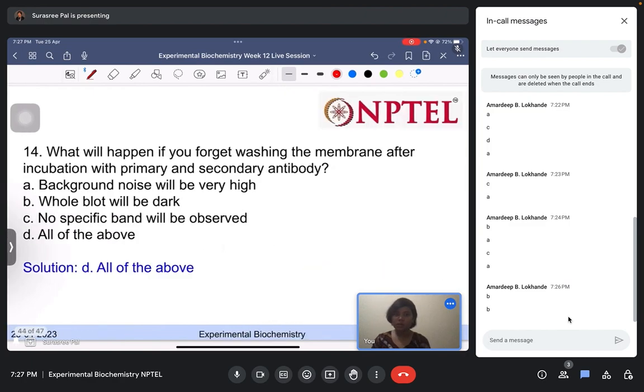So actually all of these problems might arise. If washing is not done correctly, background noise will be high, which is why the whole blot might be dark, and if there is background noise, no specific band can be observed. So the correct answer is all of the above.